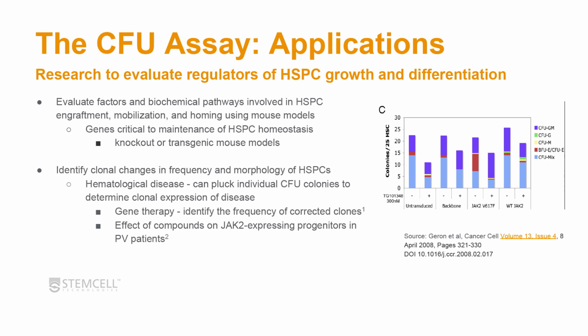Another use of the CFU assay, especially when you're looking at gene therapy approaches, is to recognize that you can identify the frequency of your particular manipulation, and whether that is high enough for those cells and for that disease to be corrected in general.